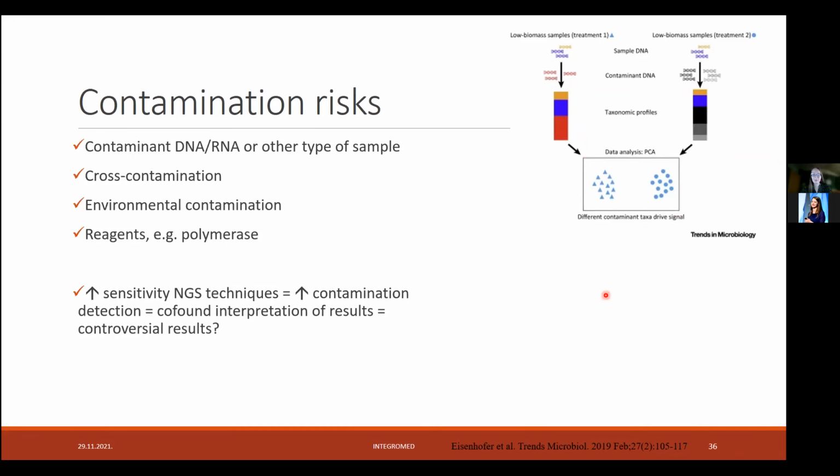And if we go a step back and remember that these are actually identical samples, just the contamination is what differs. So that, of course, makes us worry and makes us admit the significance of the contamination in the microbiome samples. And what we can do, we can sequence some controls, for example, positive and negative controls, and so on.